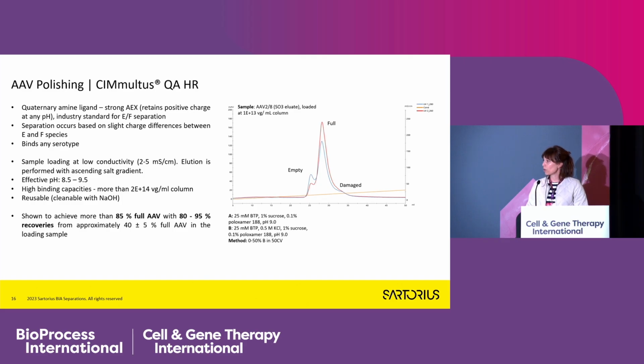Here we are showing the full AAV separation, so it is AAV2/8 coming from SO3 column, and basically you can see the 85% of full capsid with 80 to 95% recovery.